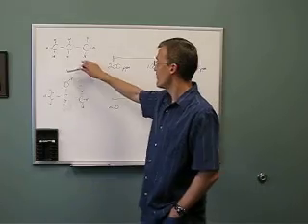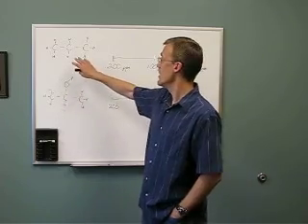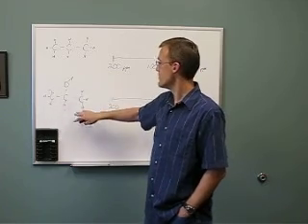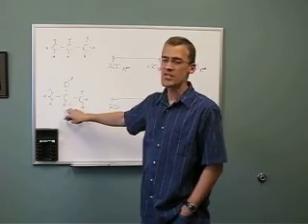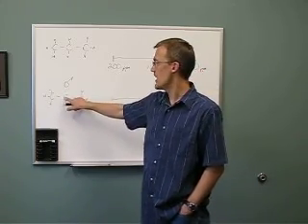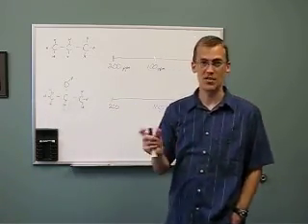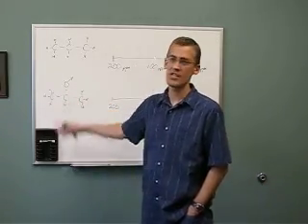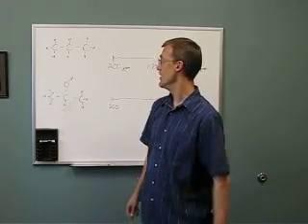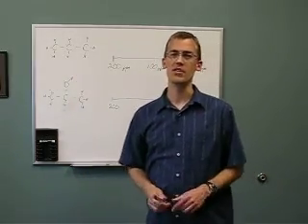So I have 2 molecules on the board. Try to start with something kind of simple. You'll look at a little bit more complicated things in lab. This hydrocarbon, 3 carbons long, is called propane. And down here, essentially the same molecule, but we have an OH, which in organic chemistry we call an alcohol. The OH is attached here at the 2 carbon, and this is propanol. So methanol is a 1 carbon chain with an alcohol group. This is propanol. In the middle, this is actually technically called isopropanol. This is the same thing as rubbing alcohol that you have in your medicine cabinets, perhaps. So we have propane and propanol, similar but a little bit different, and we'll see what their spectra look like.